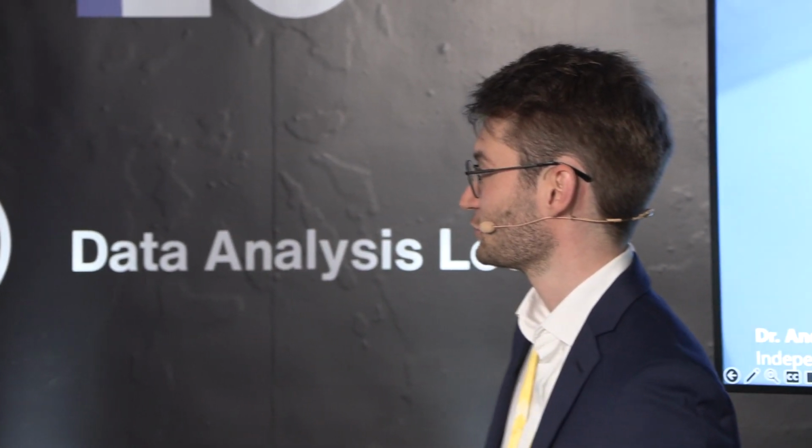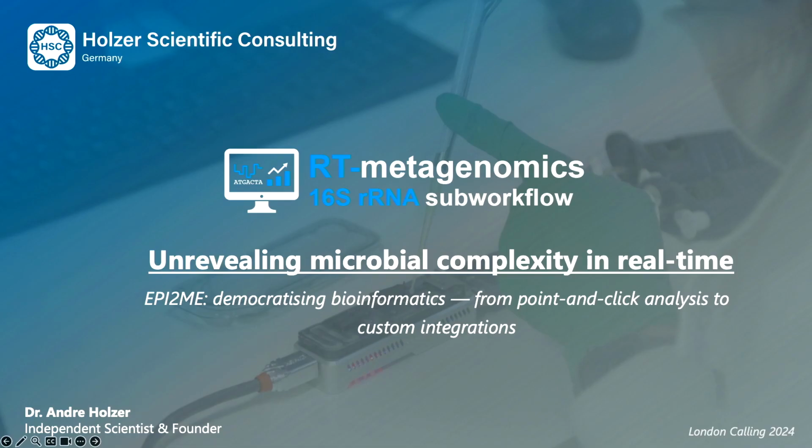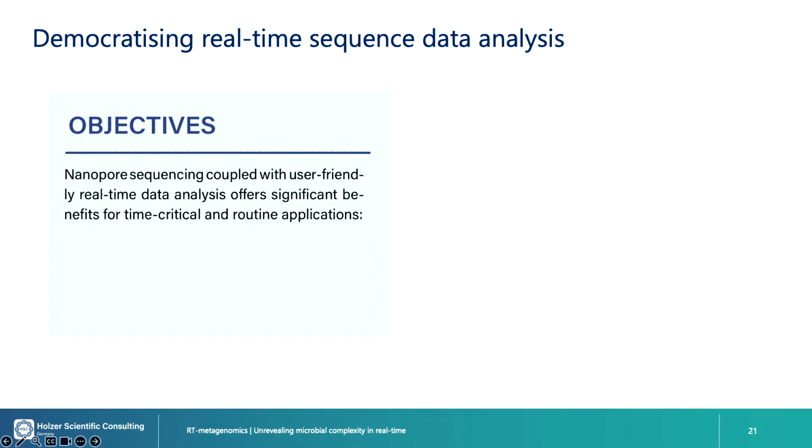And as a result of that, I would like to highlight one of the tools that we've been developing as a community over the last couple of months, which is the RT metagenomics pipeline, a real-time analysis pipeline that really does real-time analysis, and you will see that shortly. With that, I would like to give you a few examples of why we think real-time is essential.